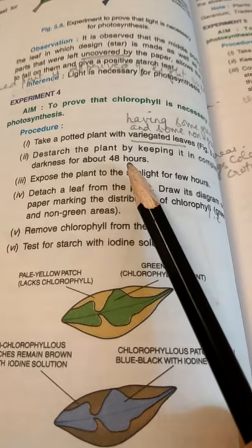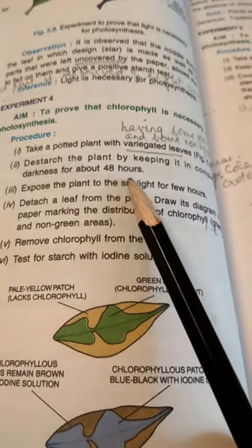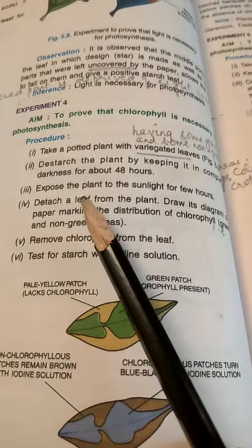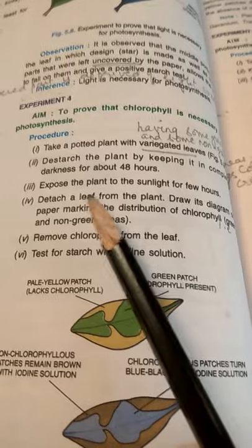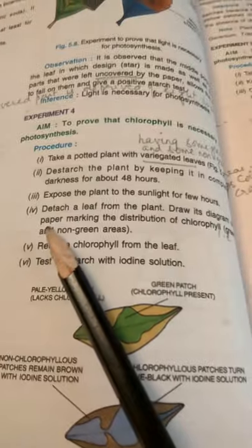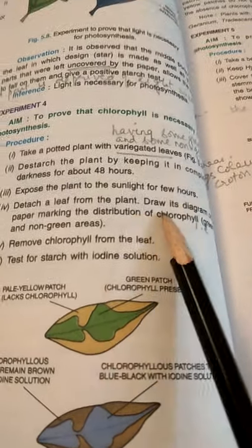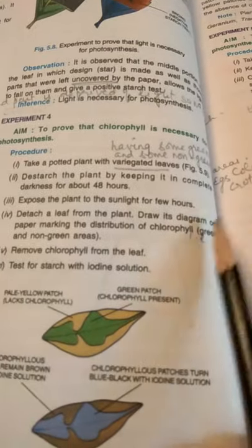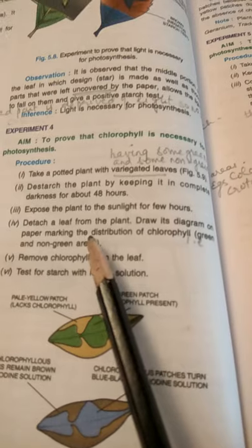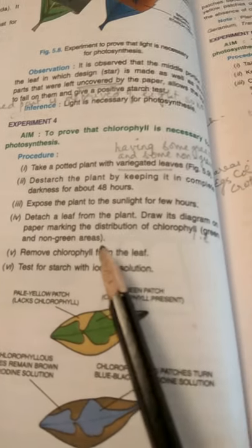We'll take this potted plant with variegated leaves and keep it in the dark room for at least 48 hours to destarch the leaves. Then we will bring back the plant and expose it to sunlight for a few hours. Then we will pluck one leaf and draw its outline on paper, marking the green and non-green areas — that is, the distribution of chlorophyll.